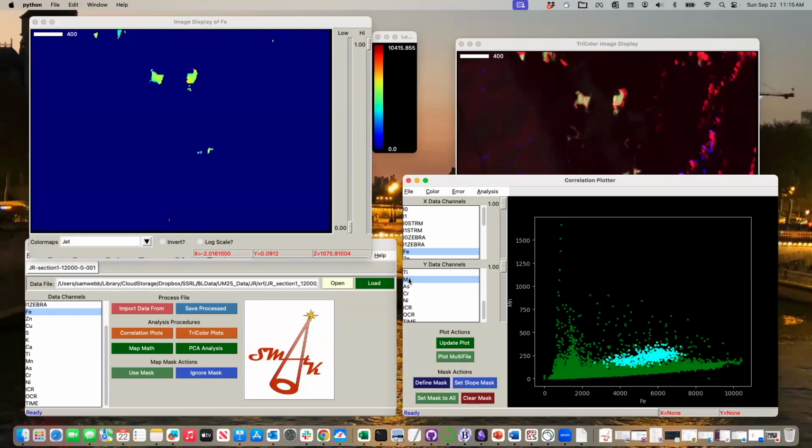Now, these plots are nice, and for presentations, I might just screen capture things and let it out. But if I'm going to actually make a figure for a real paper, I'm not a big fan of matplotlib necessarily. So you may want to put this into your favorite plotting program. If you go to File, there's an Export button. If I click on that, it will say in the left corner here that the correlation data was saved to the clipboard.